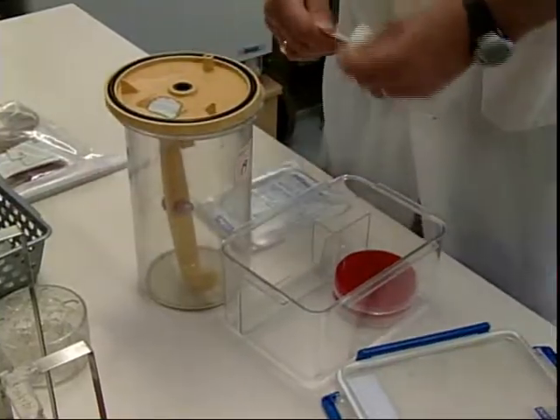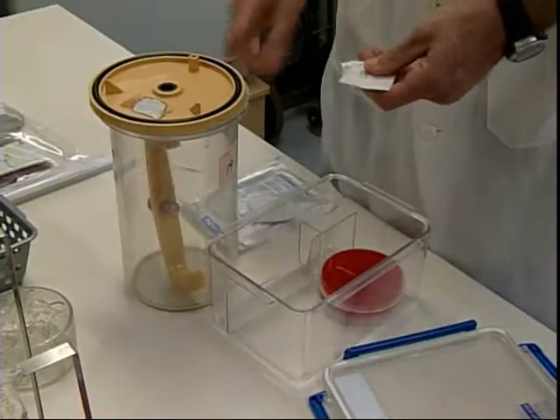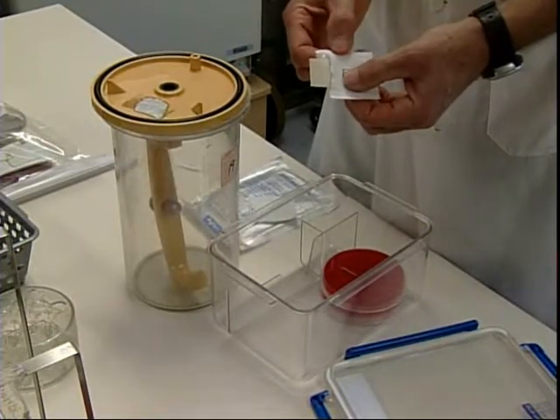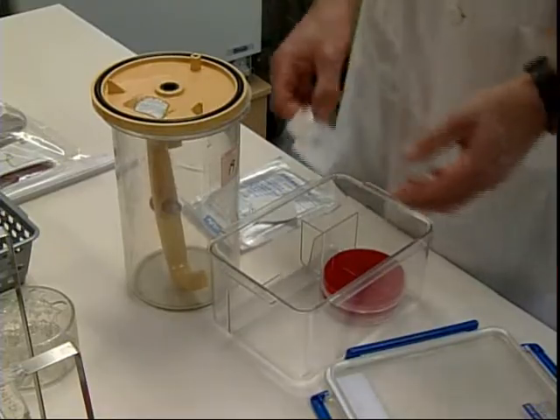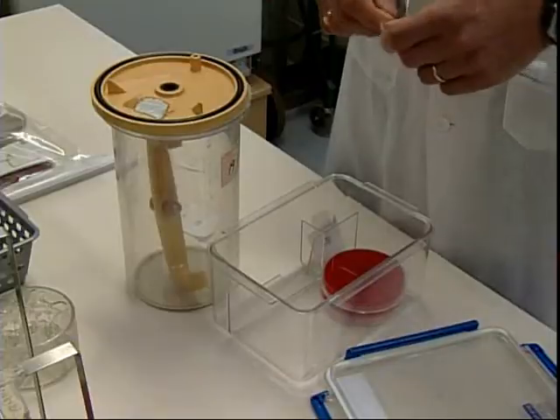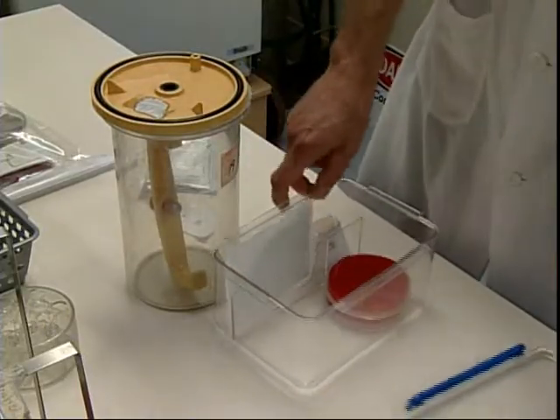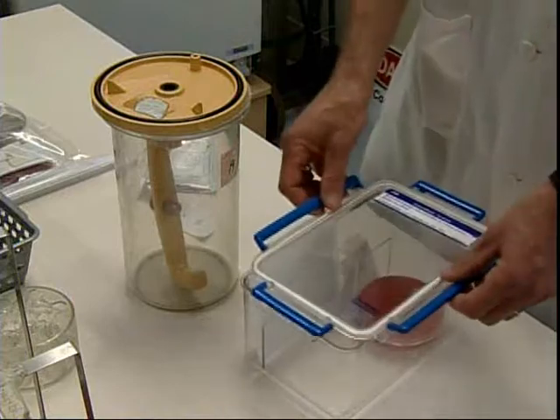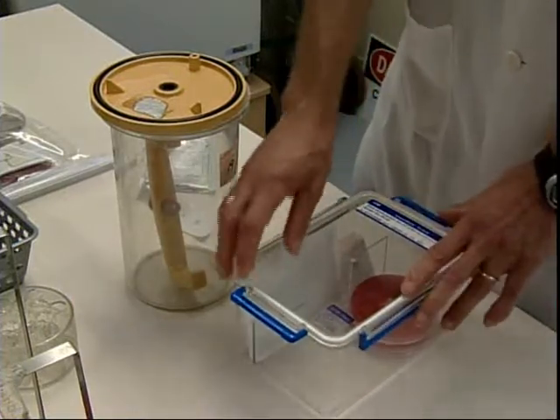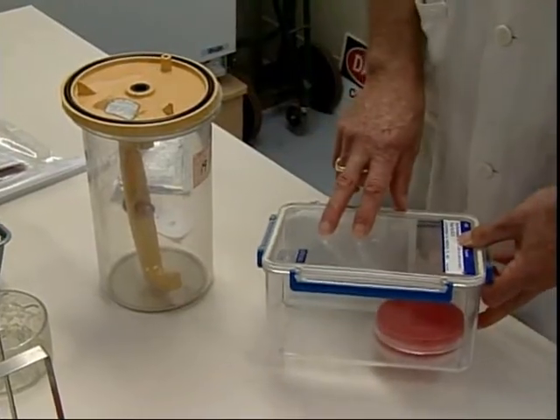We'll put an indicator in to tell us whether anaerobic conditions will be met. And under anaerobic conditions, this indicator is white. In the presence of oxygen, it starts to turn pink. And we have a gas pack that's put in, and then the container is sealed. That gas pack produces hydrogen gas, and that hydrogen gas binds with the oxygen in the jar to produce water.